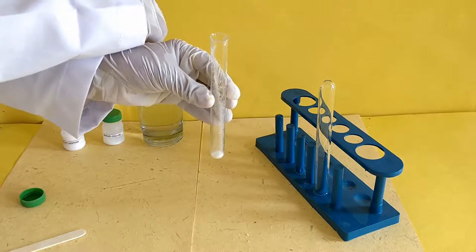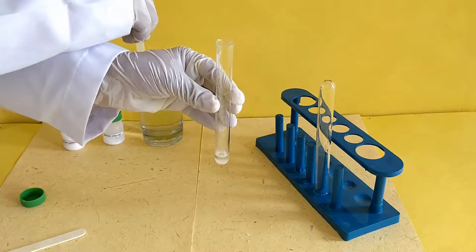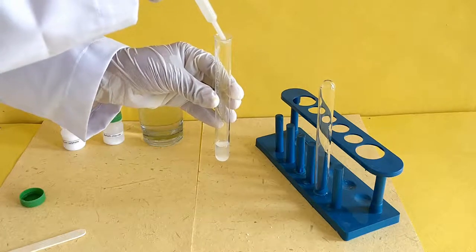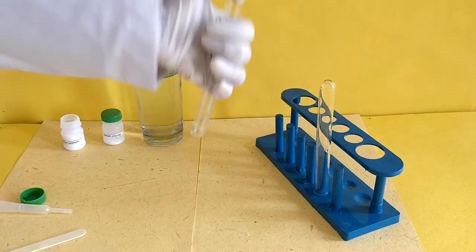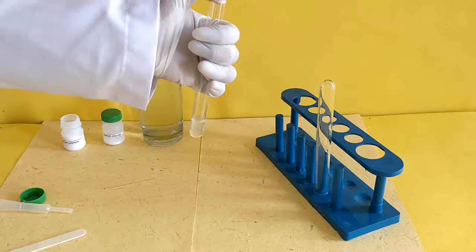Take about half a spatula of barium chloride in a test tube and fill it up to one-fourth full with water. Shake the test tube till the salt is dissolved to prepare an aqueous solution of barium chloride.